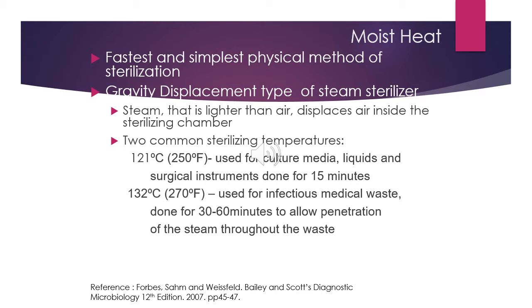You usually employ two common sterilizing temperatures. The more common one is 121 degrees Celsius, which is used for media, and you apply this for 15 minutes. The other one is 132 degrees Celsius, and you usually do this for 30 to 60 minutes, and you use it for infectious medical wastes.